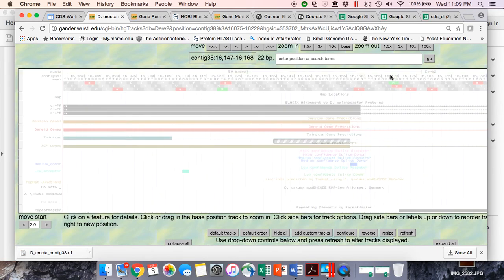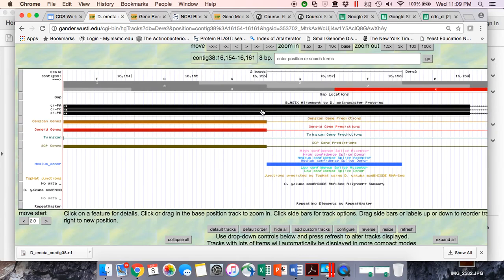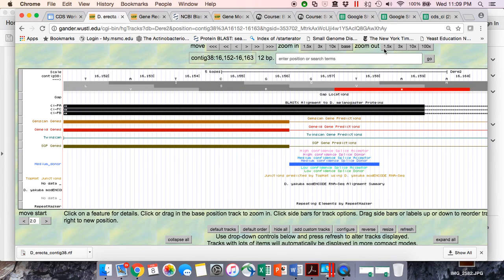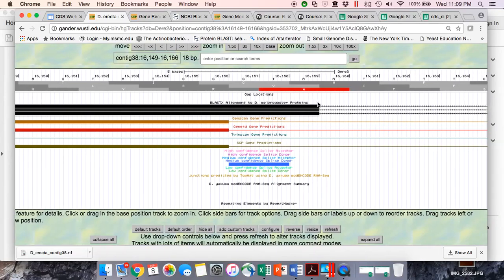So I guess a better way of saying that is, sequencing data is a good confirmation for a splice site, but lack of sequencing data doesn't tell us anything because some areas of the transcripts just don't get sequenced very well. So all of that considered, this GT looks like a pretty good splice site. So we would call this G the last of our exon.